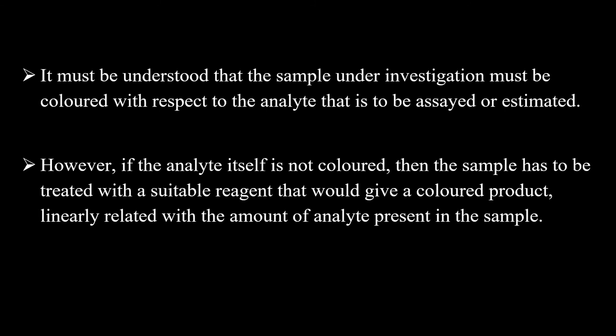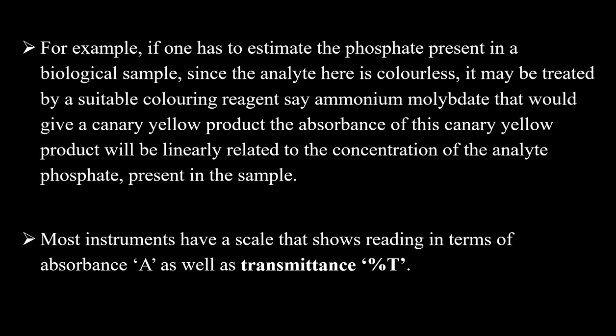It must be understood that the sample under investigation must be colored with respect to the analyte that is to be assayed or estimated. However, if the analyte itself is not colored, then the sample has to be treated with a suitable reagent, which would give a colored product linearly related with the amount of the analyte present in that particular sample.